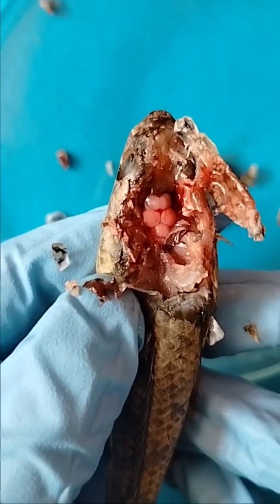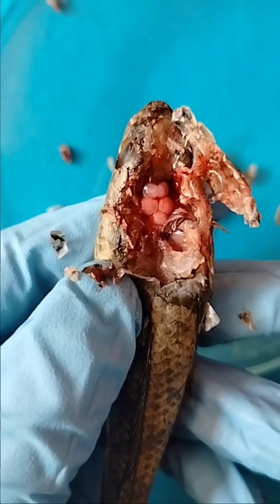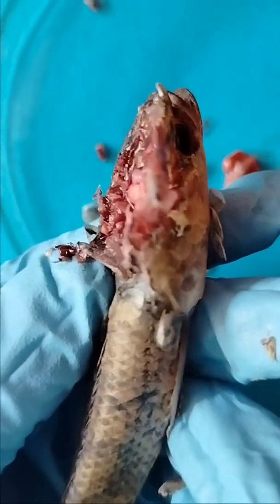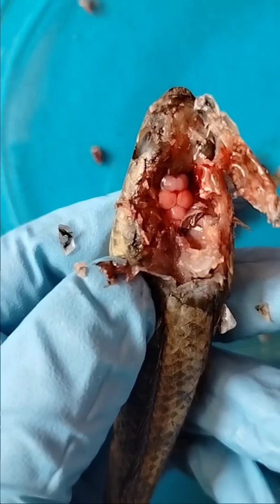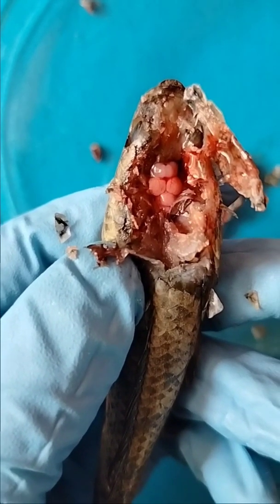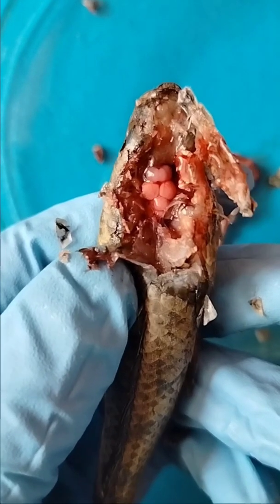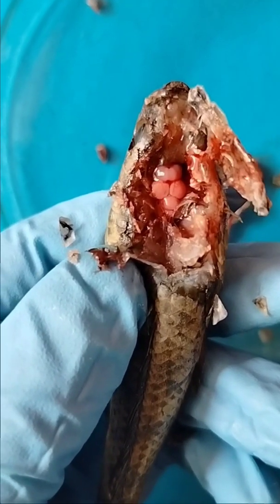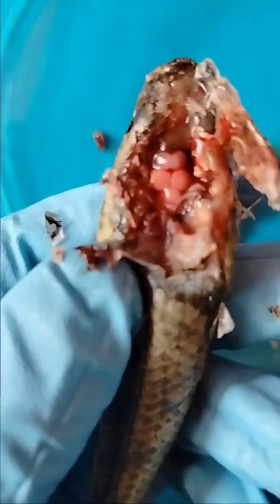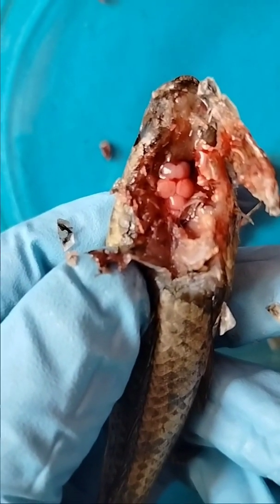The nervous system of Channa marulius comprises the central nervous system, peripheral nervous system, and sympathetic nervous system, as we have already studied in earlier classes. The central nervous system includes the brain and the spinal cord, and this brain and spinal cord are well developed in fishes, and in Channa marulius too, it is highly well developed.